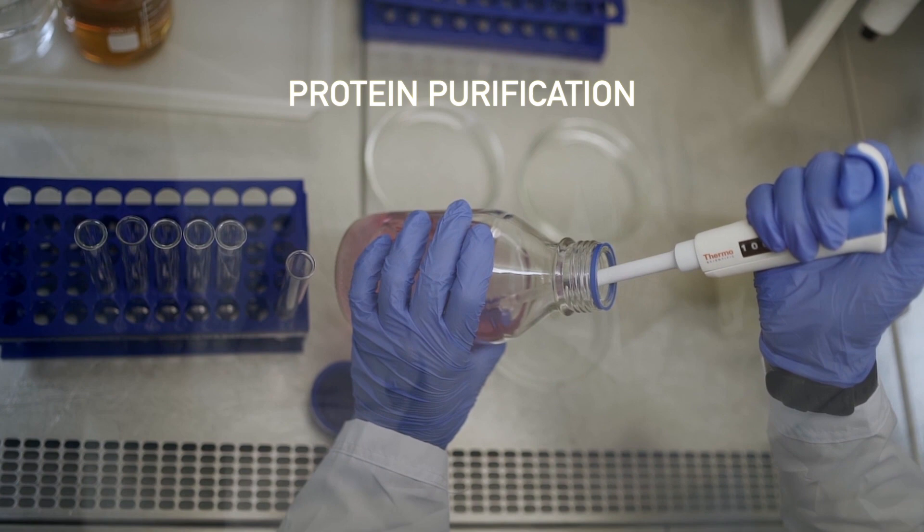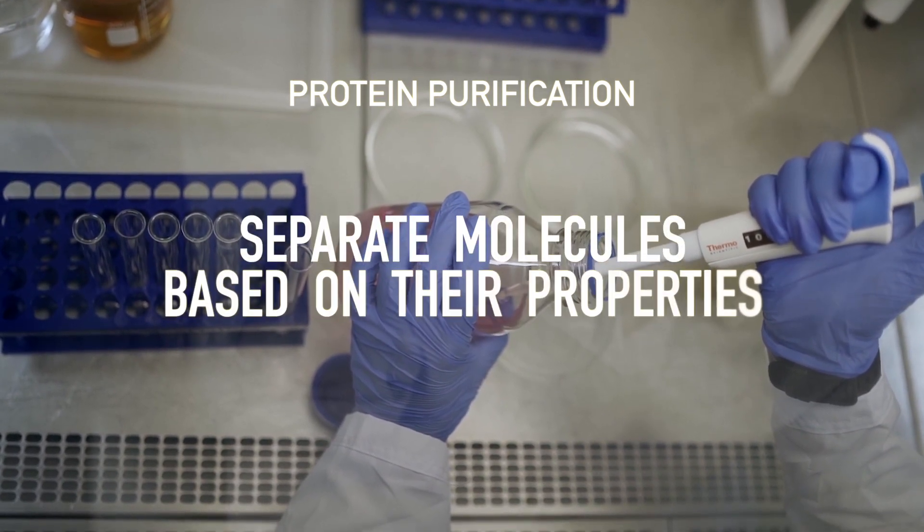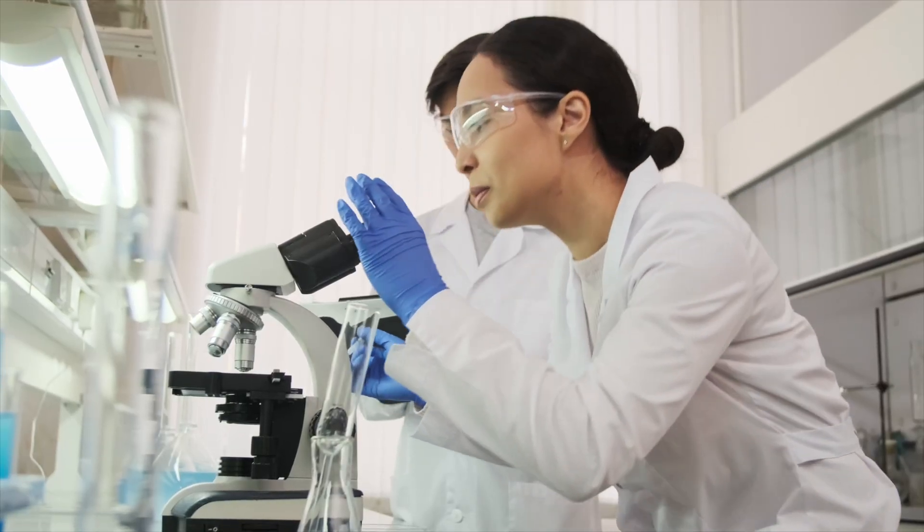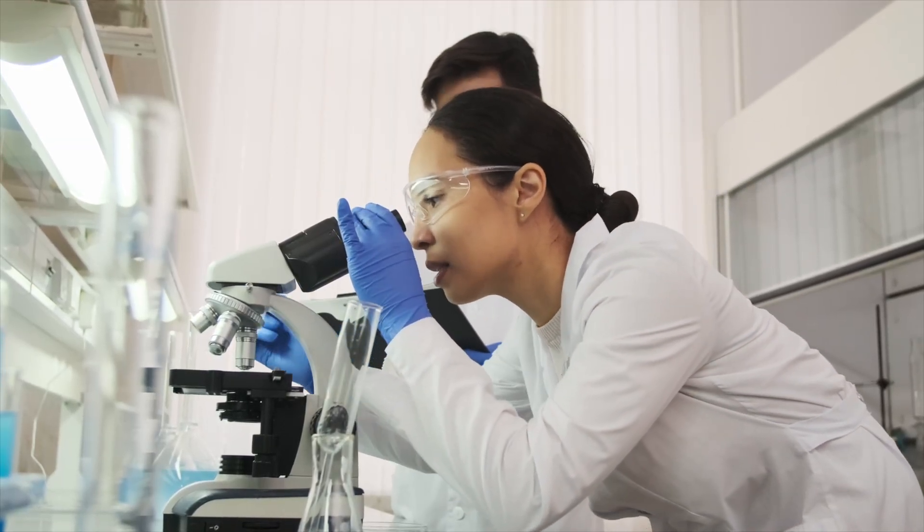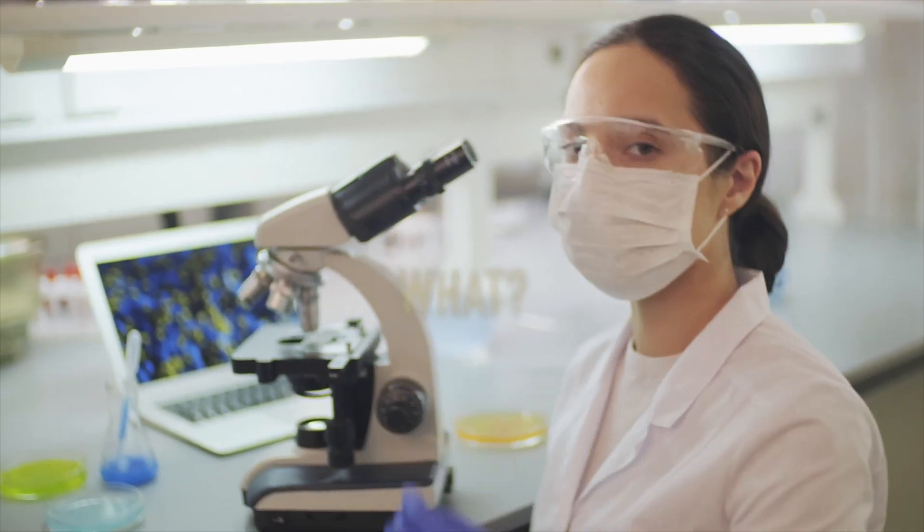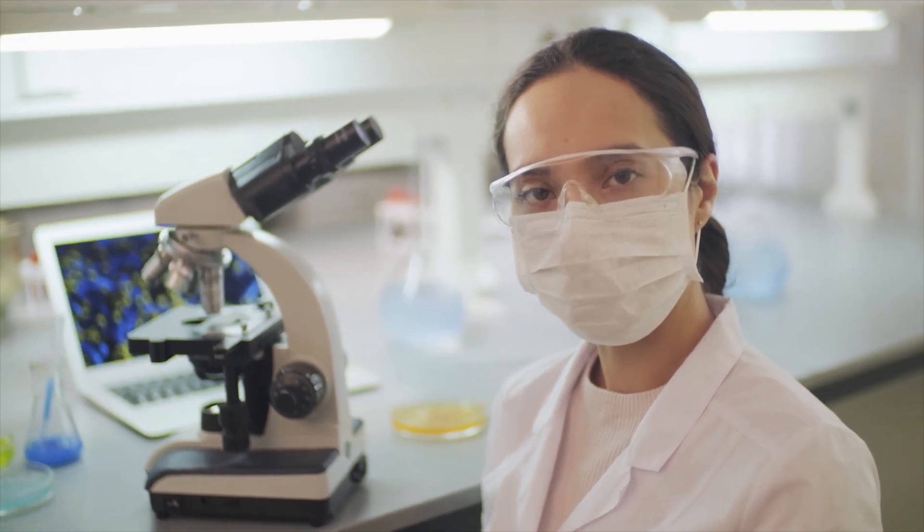The essence of protein purification is to separate different molecules based on their different properties. We could try to go in with a microscope and pull out every molecule that we want, but we don't have tweezers that small, and there are millions of copies of our protein in each cell in this flask. We're going to need a better way.